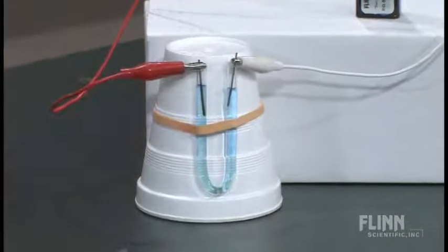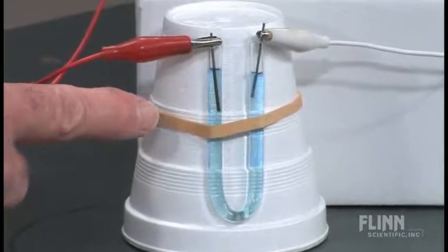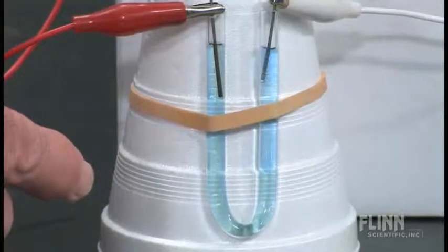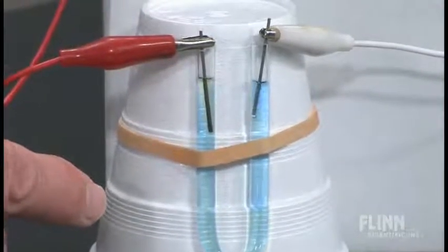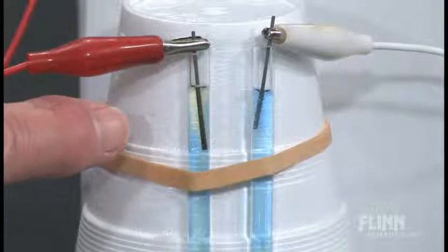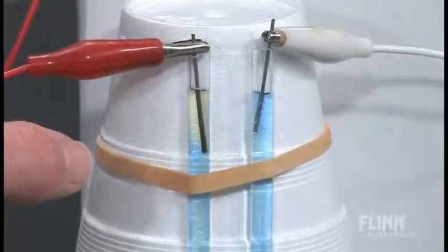And we can watch as it goes. You can see bubbles forming, more on one side than the other. And the color's not real dark, but as time goes on, notice that this side gets more blue and this side gets more yellow. That's the key to what's really going on here.